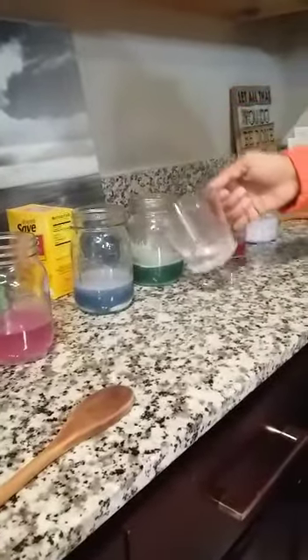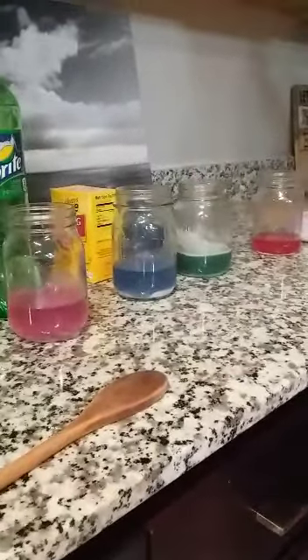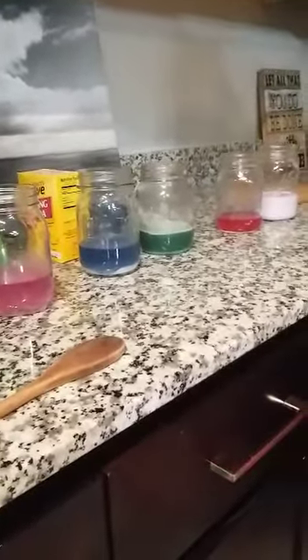Look how it turned into a nice blue. So it really lightened it up. It really did. It really changed the pH in the mixture. This is so cool. I love that.